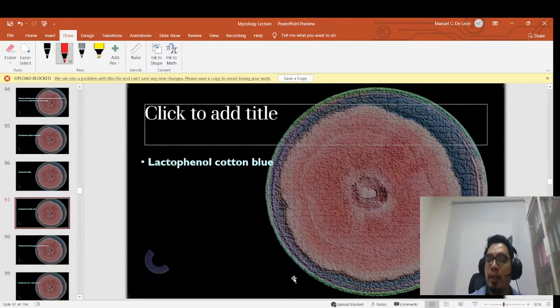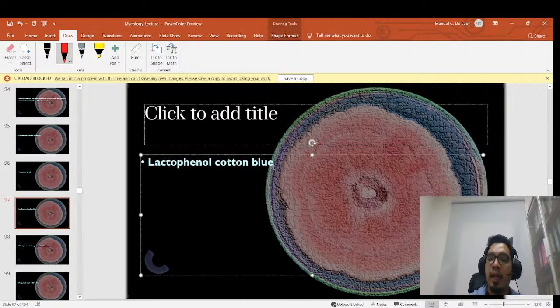Another name for this one is the Amann stain, or Amann. All right, so I'll add it here, and then I'll send it to Sir Mac afterwards. Amann's stain. Okay. So you guys are familiar with the other names as well.